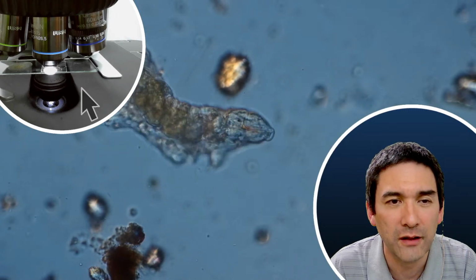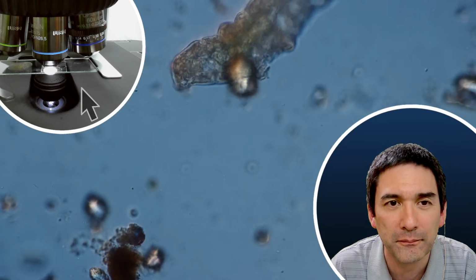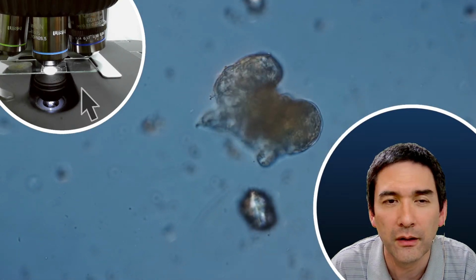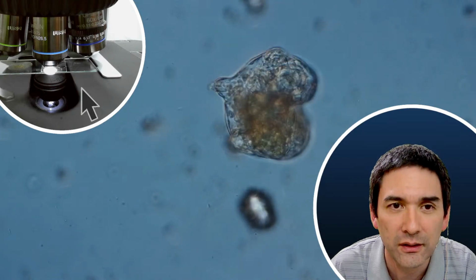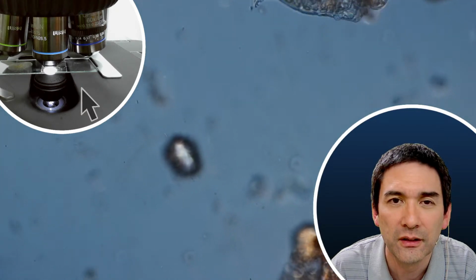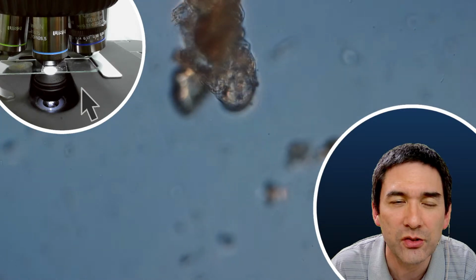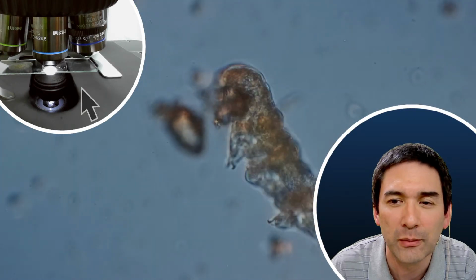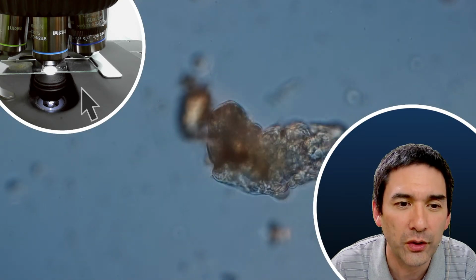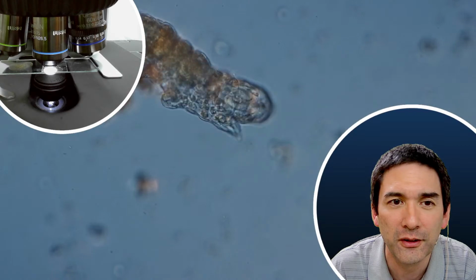Folks, I've been talking for 1.5 hours again. I think it's time to, yeah. Can you freeze a tardigrade? Yes, tardigrades are very cold resistant. Not so much heat resistant, but quite cold resistant. So it's actually something I might be trying. A suggestion is to dry them and see if they're able to survive a week. But I think I'm going to call it quits for today again. And at least we found a nice one here.